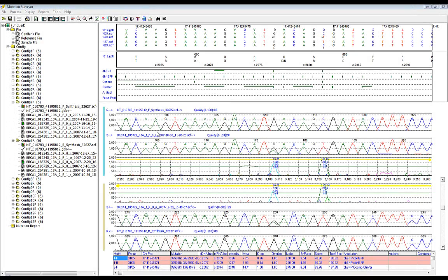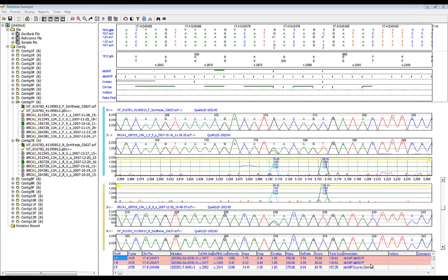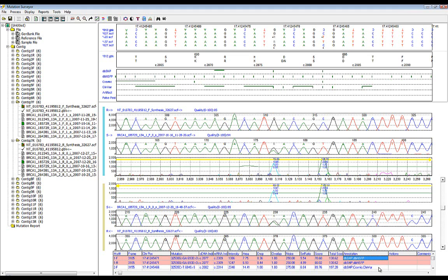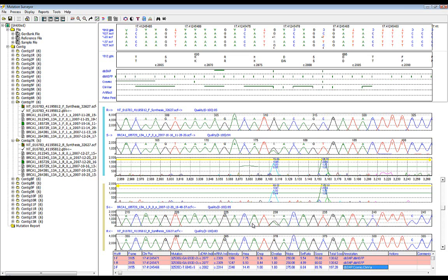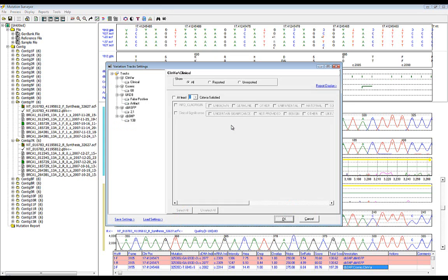To conclude the webinar, I would like to cover the new display options associated with the knowledge database. The new version of Mutation Surveyor has also added an annotation column to the mutation report at the bottom of the screen. If a mutation has reported annotation, a tag will be displayed in that cell for the corresponding databases. You can use this column to display more details about the annotated variants, such as dbSNP ID, clinical significance, or dbNSFP information. To change these options, navigate to the Track Settings icon at the top of the page.